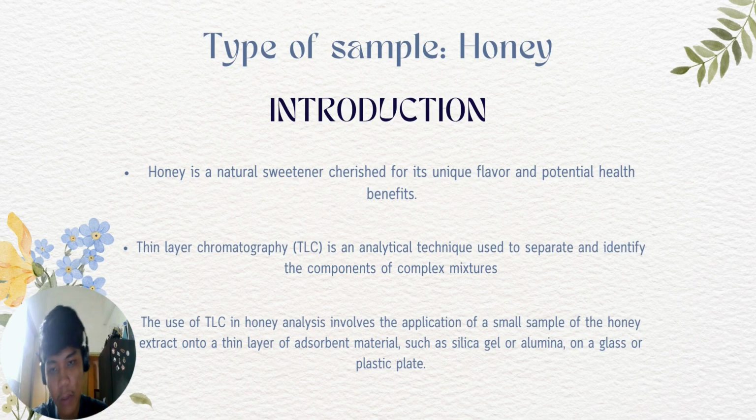The use of thin layer chromatography in honey analysis involves the application of a small sample of the honey extract onto a thin layer of adsorbent material such as silica gel or alumina on a glass or plastic plate. So that's all from me.